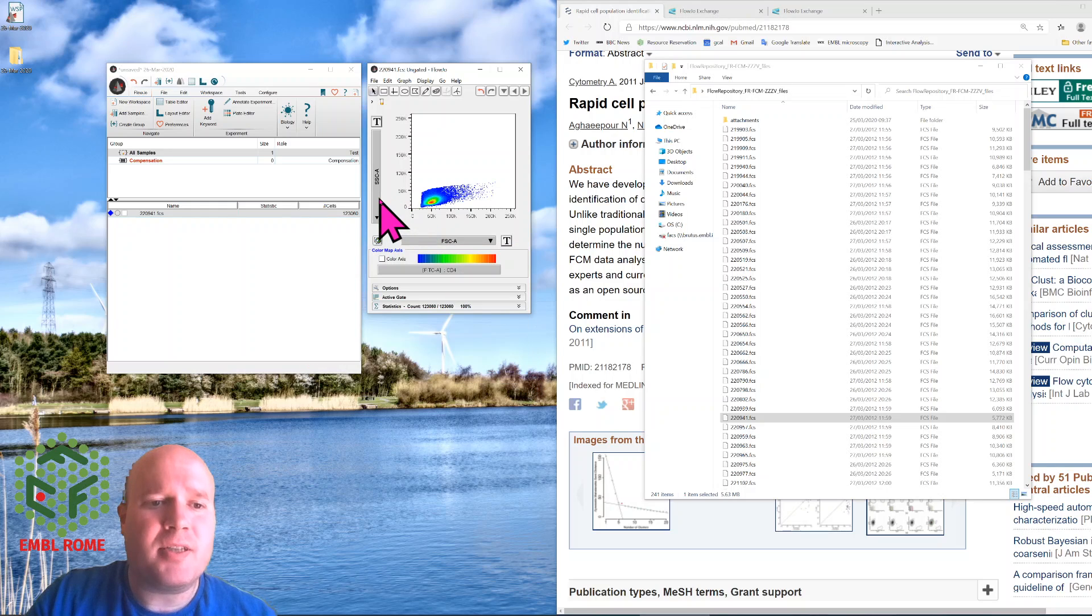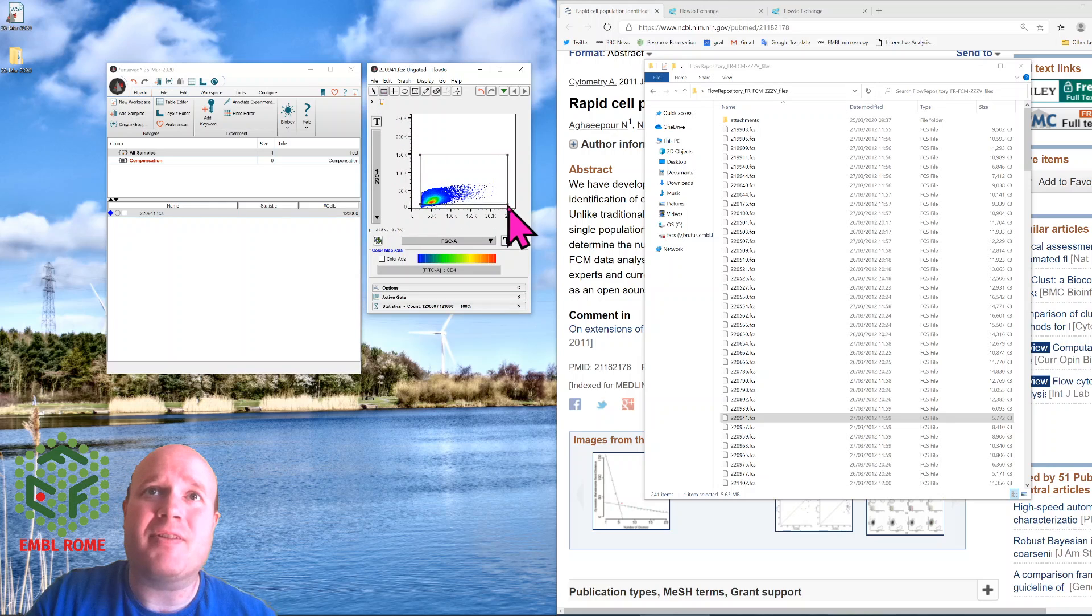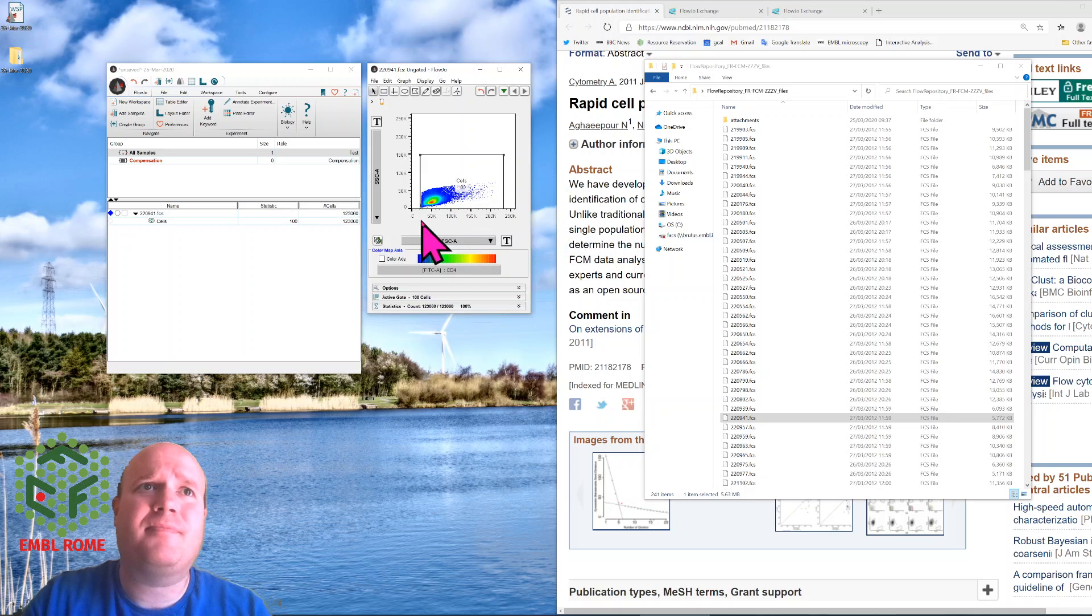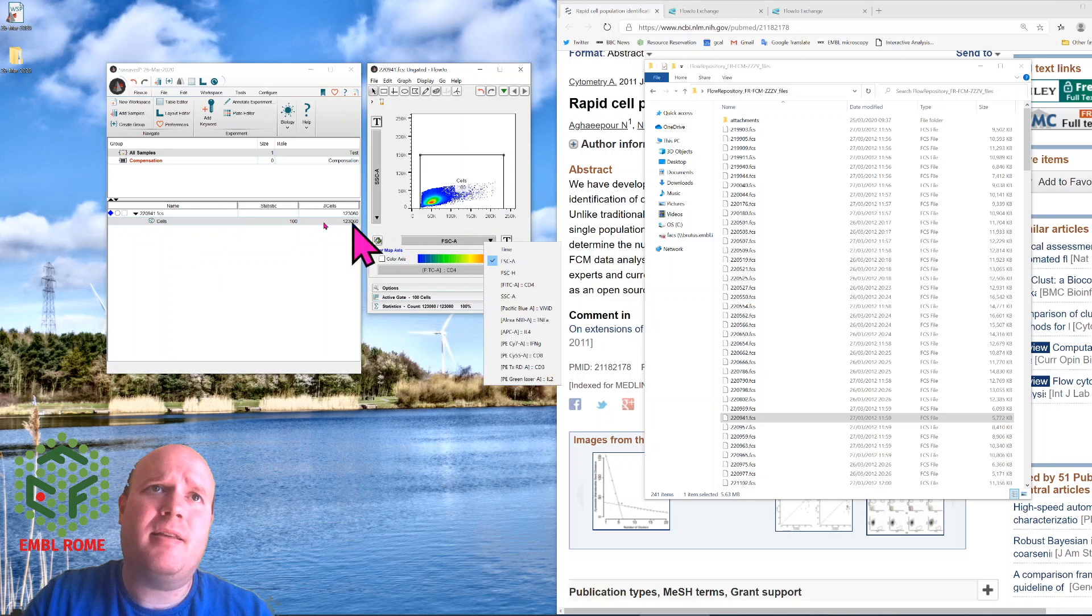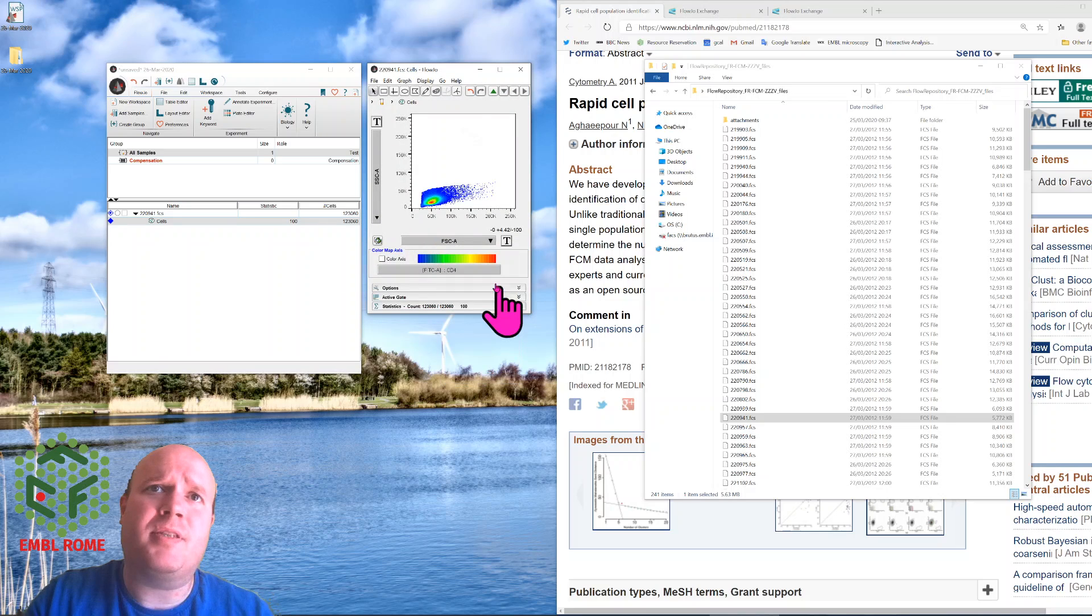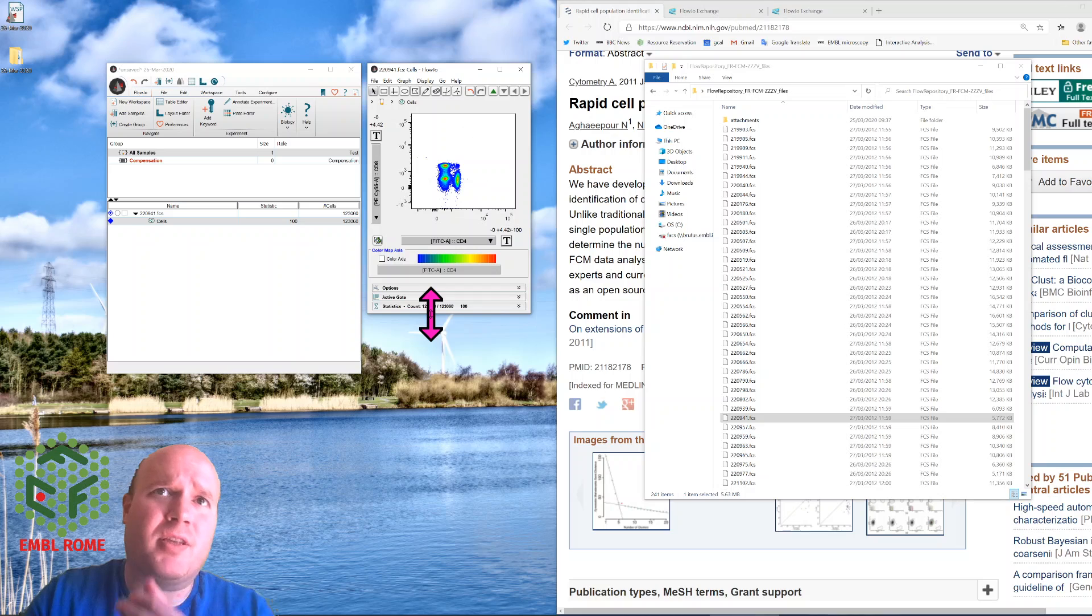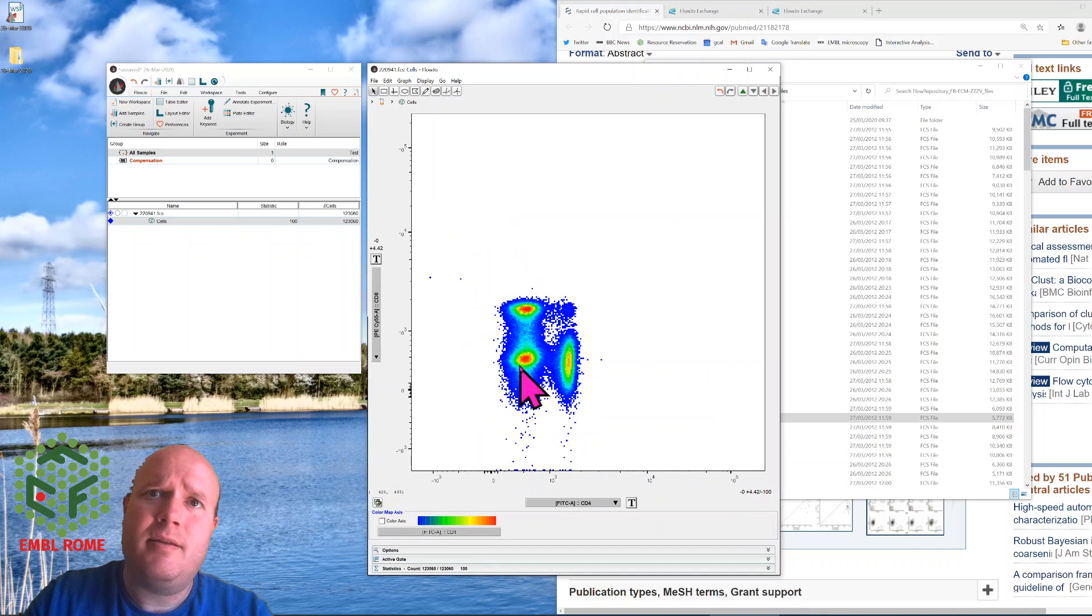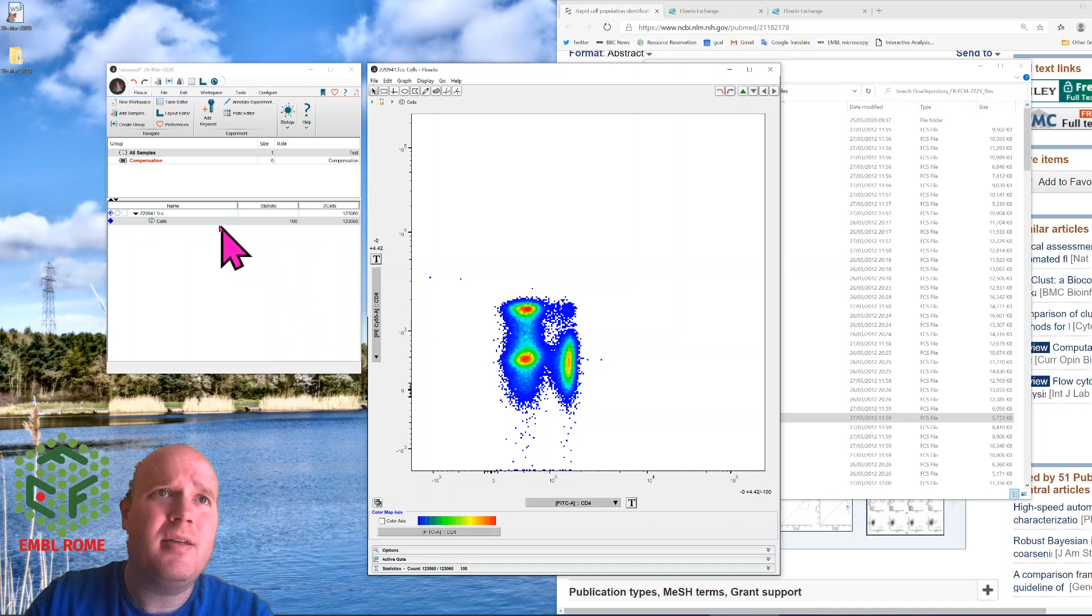So one of the first caveats with FlowMeans is that it only works on gated data. So first of all I'll just make a very simple gate, so call it all cells, or cells. I press cells, and I'm going to choose CD4 and CD8 here, just so we can have a look at the data. We can see there's three main populations here. Double negative, CD8 positive, CD4 positive, and a small double positive population.